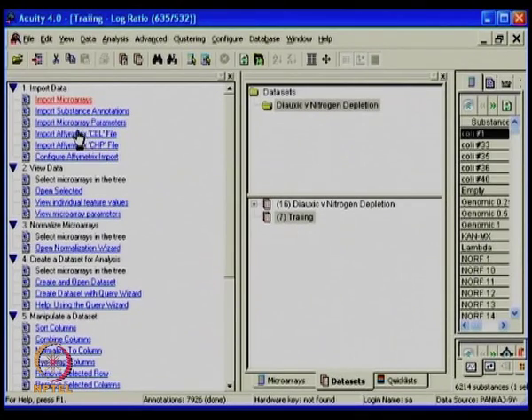Then the third one is microarray parameters, which is stored in the form of a tab delimited .mdt file, which allows one to trace all the details. The other three you are seeing are based on Affymetrix, which is actually a CEL file. Their image is a DAT file, which they convert to the intensity level CEL file. That can also be handled, but it just does an RMA analysis, where they have moved a little bit further for the different kind of analysis. But it does give the opportunity even to look at Affymetrix outcome data.